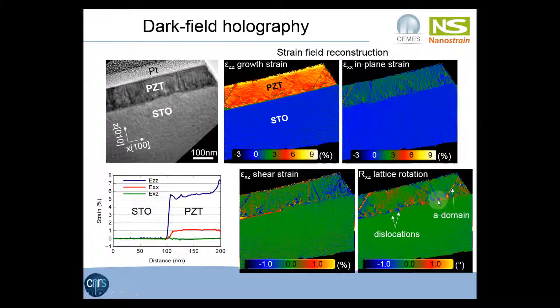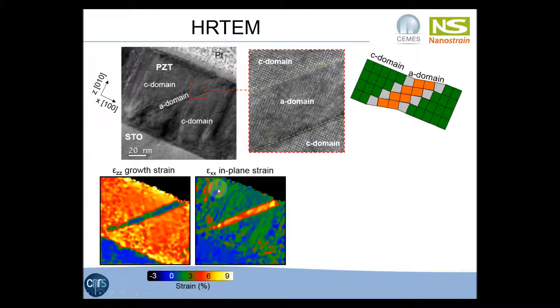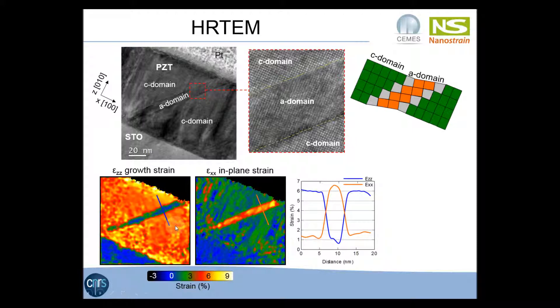To improve the resolution, we can use high-resolution imaging. This is a high-resolution image of an A domain between two C domains. In the A domain, the C parameter is in the in-plane direction, so the lattice is rotated by 90 degrees compared to the C domain. These are two strain maps calculated by geometrical phase analysis — the strain in the growth direction and the strain in the in-plane direction. The colors are inverted between the two images because the C and A parameters are inverted in the A and C domains. Profiles across the domain show a variation of about 5%, corresponding to the difference between the A and C parameters.